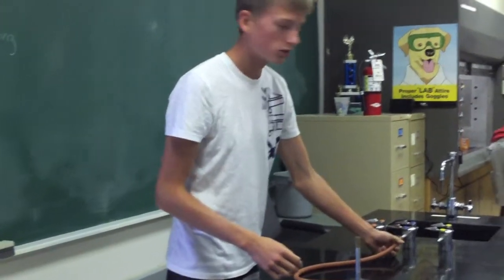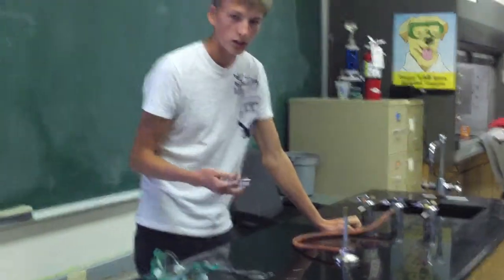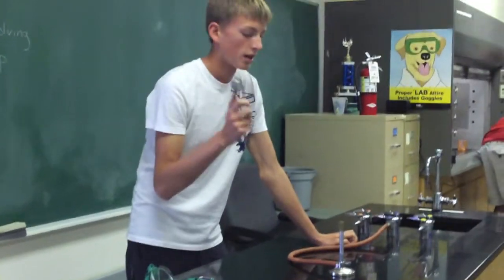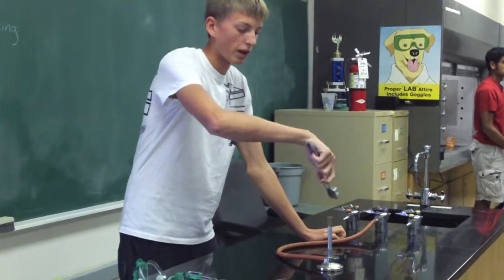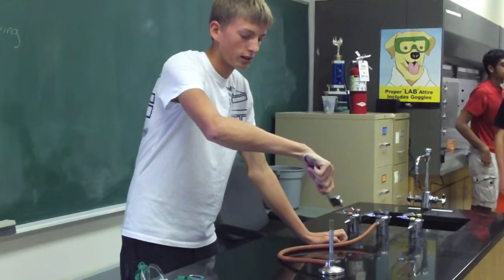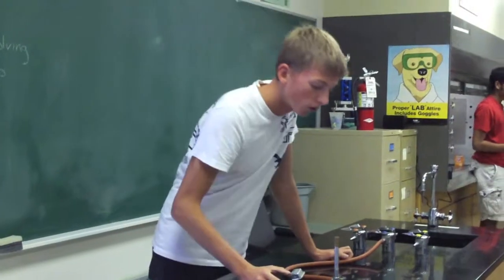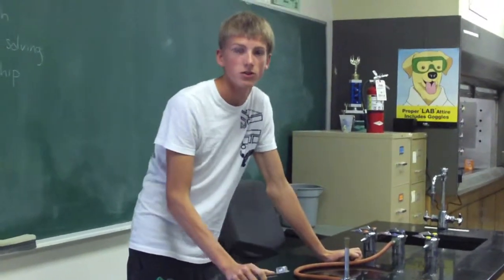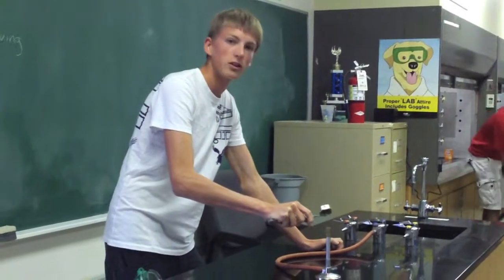Let's start. We connect it to the gas valve. Take the striker in one hand. Now, when you're trying to ignite gas, some common mistakes are people hold their hand over the gas, which causes them to hurt their hand, or they'll look over it and try to ignite it, which can cause heat to go into your face. We don't want either of those. You stand to the side, you have the striker like this, and you ignite it.